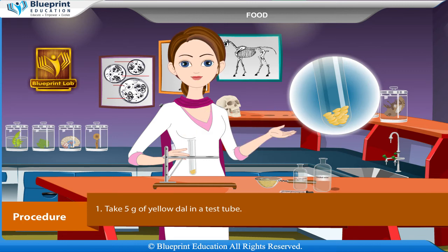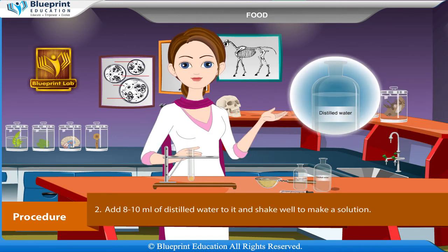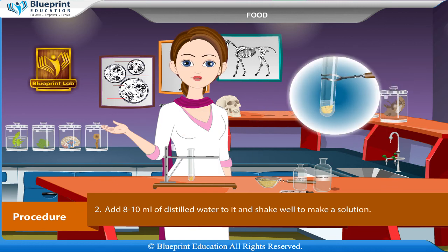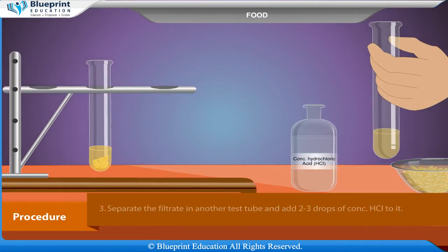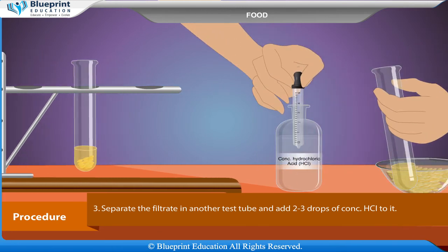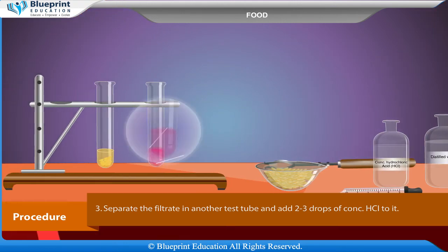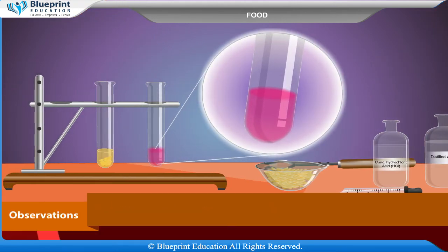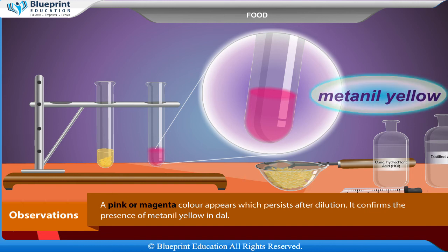Procedure: Take 5 grams of yellow dal in a test tube. Add 8 to 10 ml of distilled water to it and shake well to make a solution. Separate the filtrate into another test tube and add 2 to 3 drops of concentrated HCl to it.